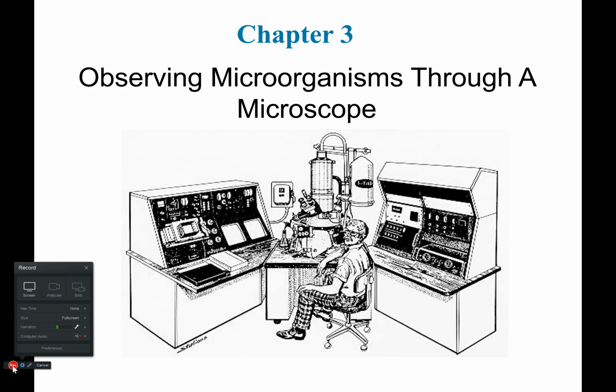They are quite large, so that's why I liked this diagram that showed that. Although, again, this is older. They have gotten smaller over the years. They do make a tabletop electron microscope now that does fit on a table, but we're still talking about a fairly large table that it takes up. And they're incredibly expensive. The tabletop electron microscope costs about $300,000.